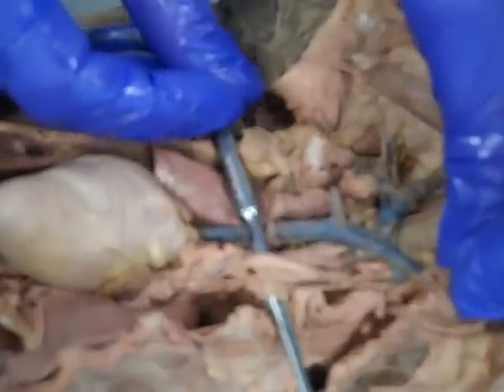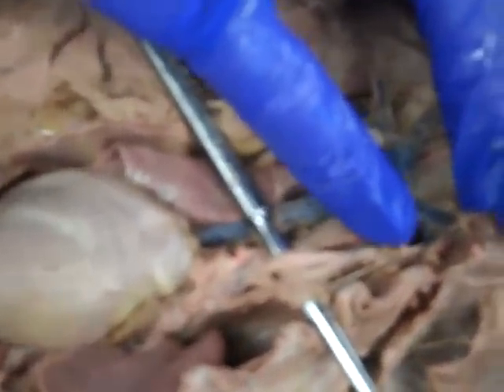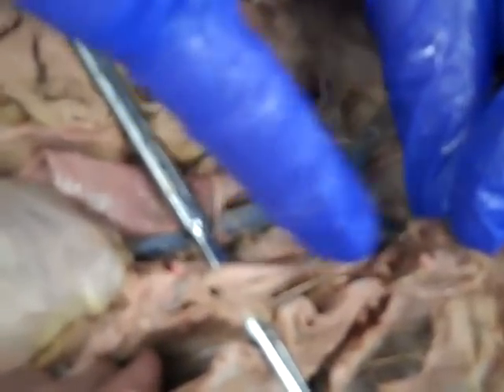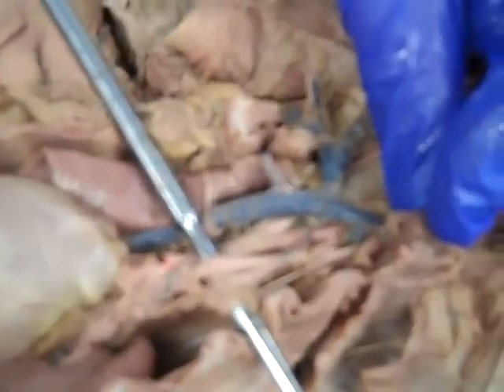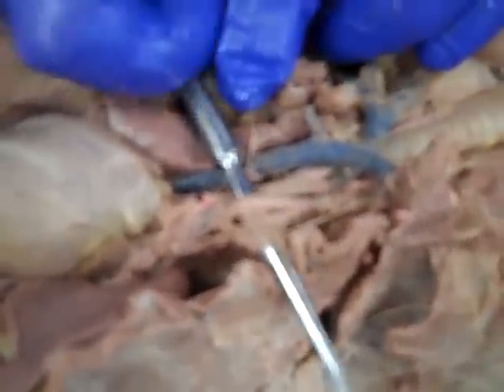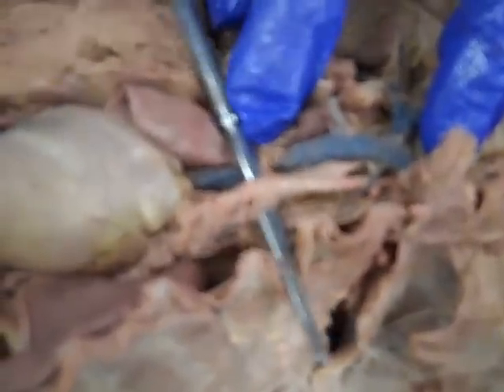One thing we can notice about this subclavian artery is right here, I'm poking a little artery that has been cut. That poor little cut artery is the internal thoracic artery. It was cut when they removed the breastplate, when they removed the thoracic wall, it got cut. No big deal. Let's go over to the one on the right here. This guy here is the brachiocephalic artery.